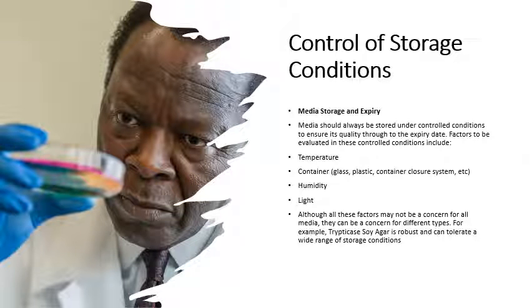So until this, the media must be kept in a conducive storage condition to avoid decaying or caking of agar.